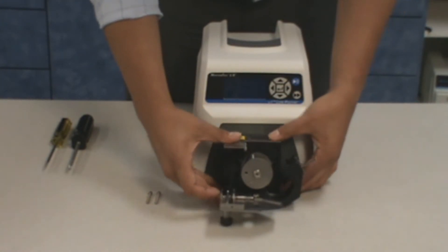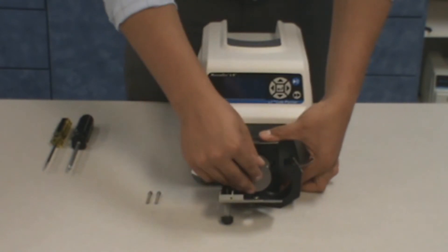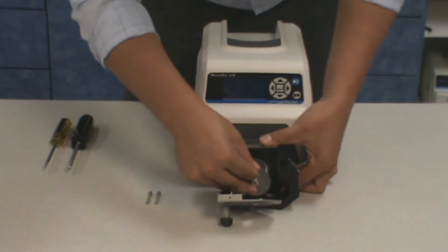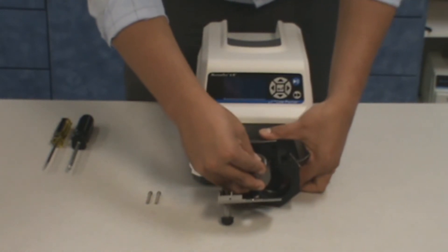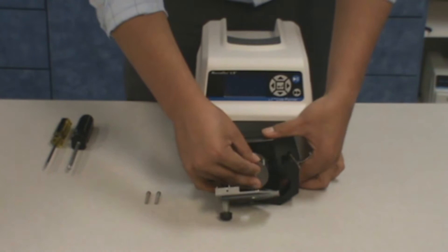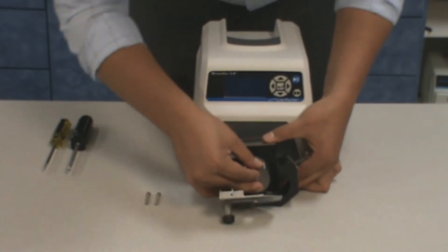Next, align the pump shaft tang with the slot in the motor shaft. If the drive you are using has alignment pins, make sure to slide the pump head alignment holes over the pins. Make sure to secure the pump head to the pump drive with the two mounting screws that are included with the head.